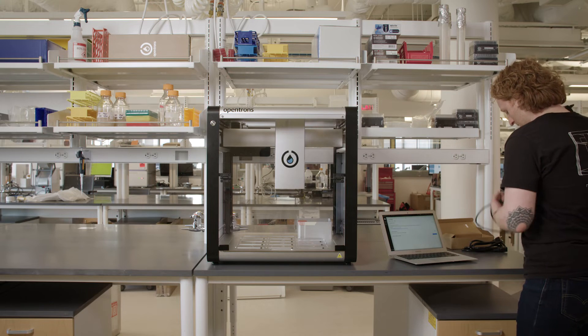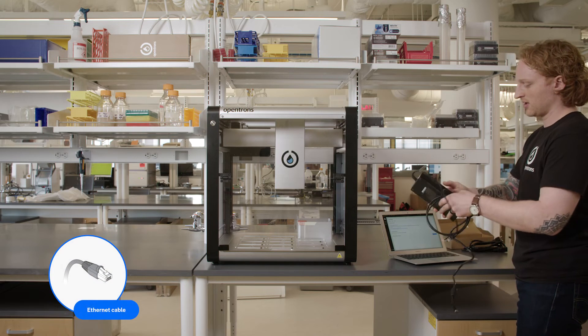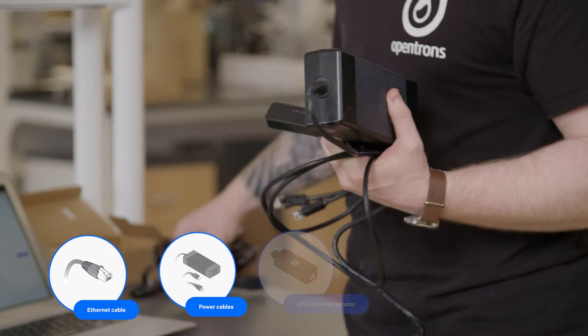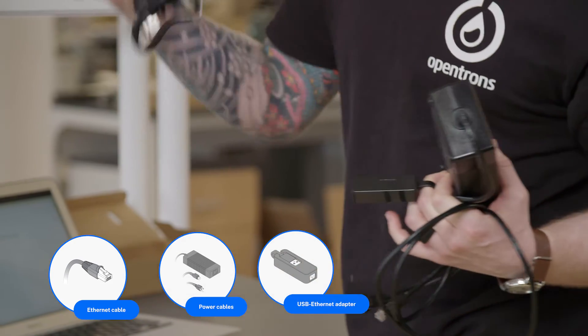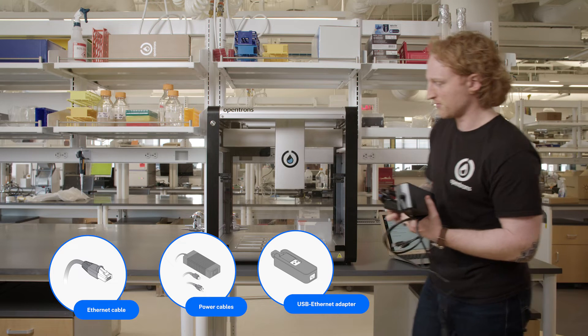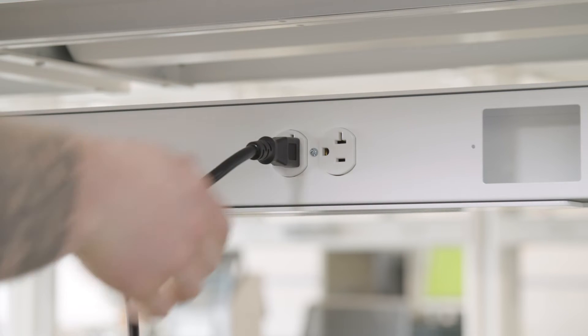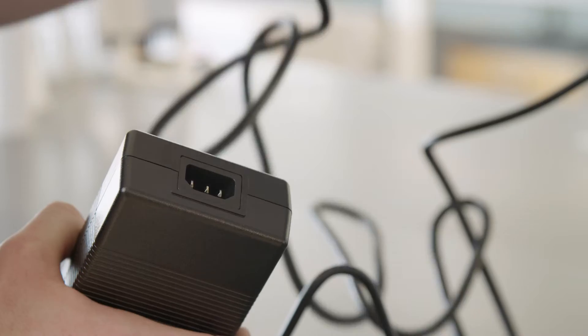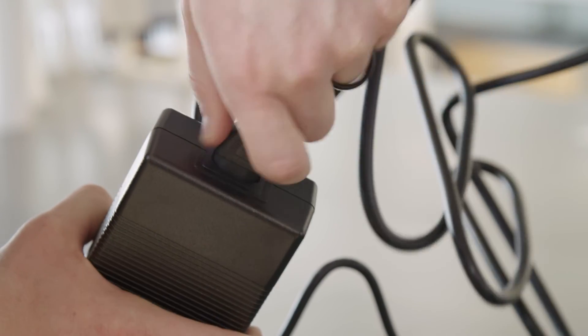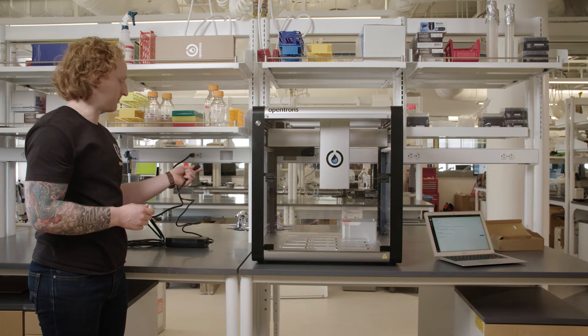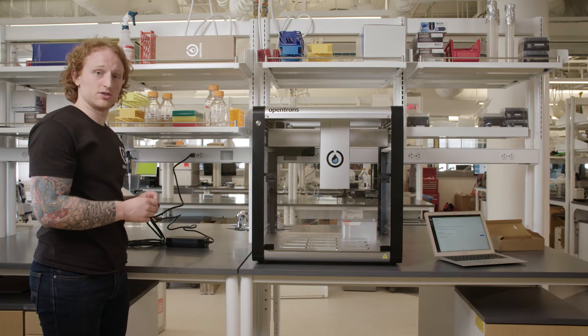I'll need the ethernet cable, the power brick, the ethernet to USB dongle, and the IEC cable. First, I'll plug in the IEC cable into the outlet. Next, I will plug in the IEC cable into the power adapter, power brick. Then I will make sure to plug in the power brick into the OT2.